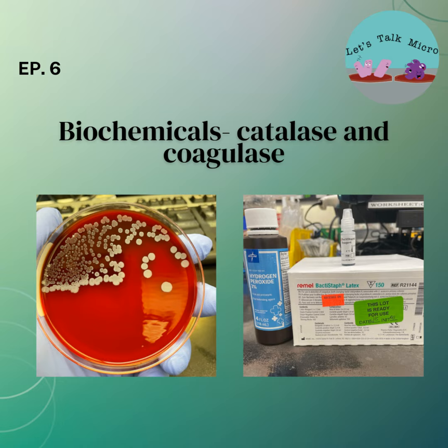It's gram-positive cocci in clusters, alpha hemolytic, and it is PYR negative. If you have gram-positive cocci in clusters, alpha hemolytic, PYR positive, then more likely than not, it's Aerococcus viridans, which is flora.